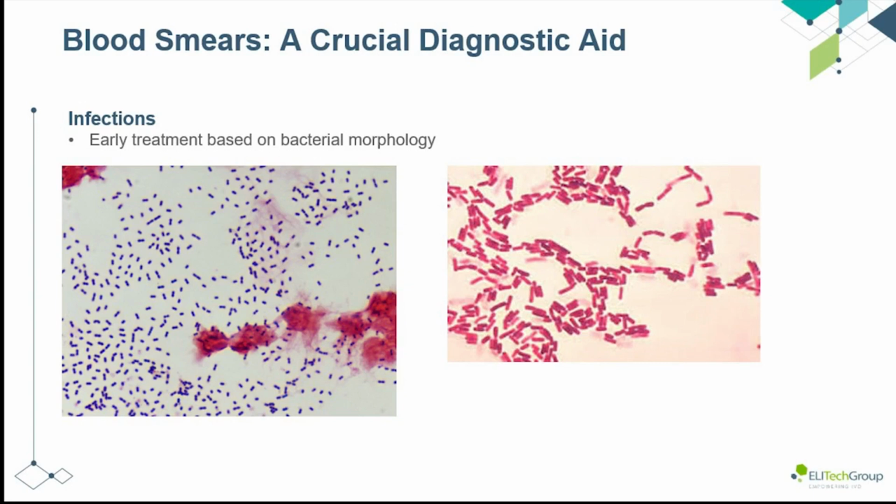On the image on the right, it shows gram-negative rods from a wound. Often gram-negative rods are more antibiotic resistant, so that might also alter the course of treatment. While there are many bacteria that show as gram-negative rods, that information gives clues to how the clinician should begin treatment while antibiotic susceptibility testing is being performed.